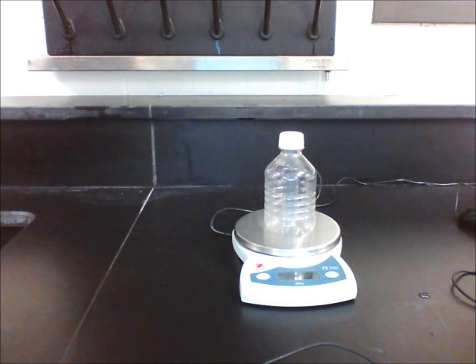Any difference might be due to experimental error, such as not wiping off the condensation before weighing the bottle, not screwing on the lid completely causing some gas molecules to escape, or using a different scale each time the apparatus was weighed.